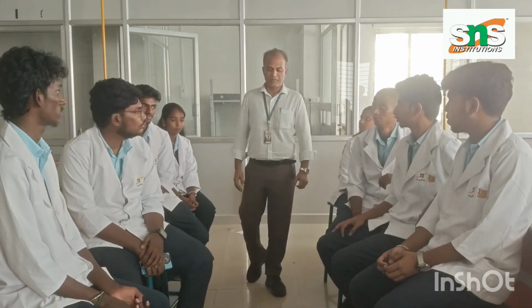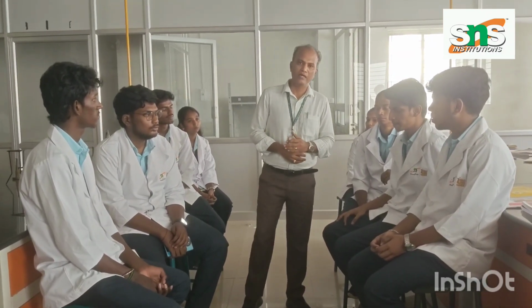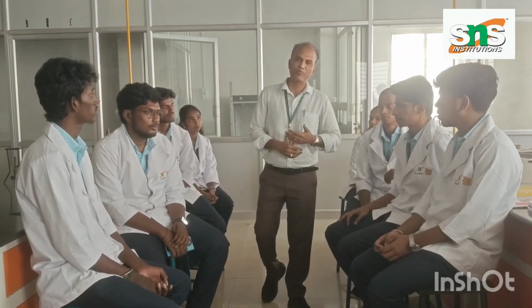So we are going to sum up the design thinking of sterility testing. As they discussed, it should vary from one department to another, and according to traditional and modern methods. The modern is nothing but an automated system, which is the composition of appropriate sensors towards pathogen and non-pathogen. So we have to identify in which lab there are more pathogenic microbes. According to the pathogens, we should develop the automated system to quickly eradicate the microbes. The first thing is to identify the suitable biosensor towards the particular strain.